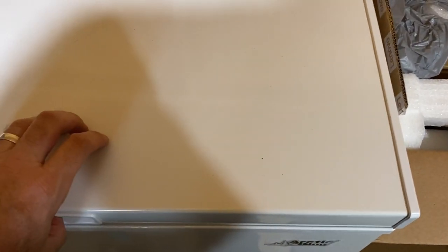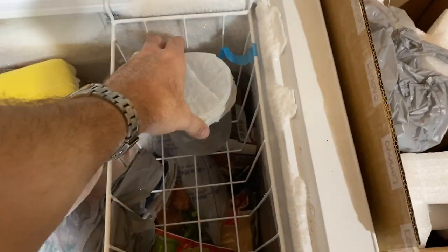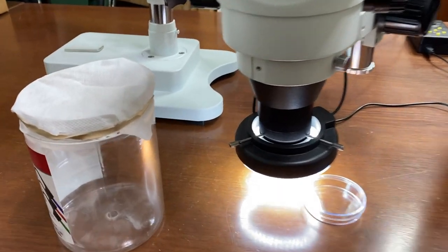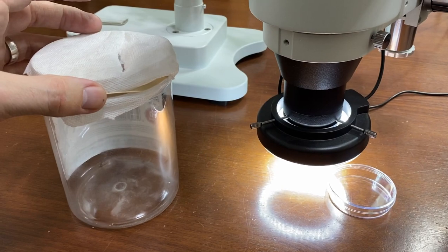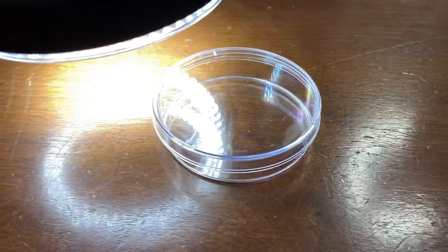Okay, it's been 1 minute, just a little over a minute, and I'm going to lift it and check it out. There it is, right at the bottom there. Okay, we're in the lab now. That's what I call it. It's starting to wake up in there, so I better put it in. I'm going to put it into this little petri dish.